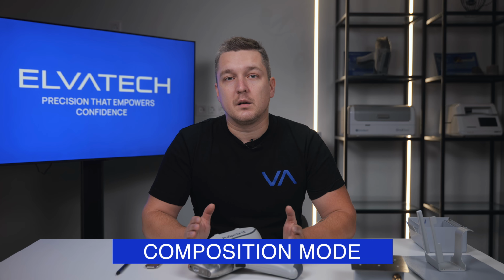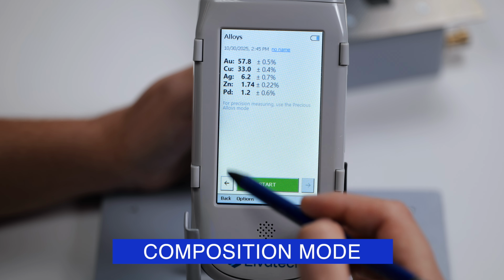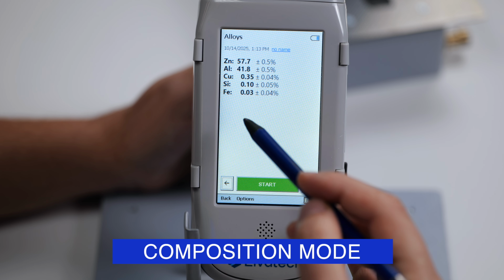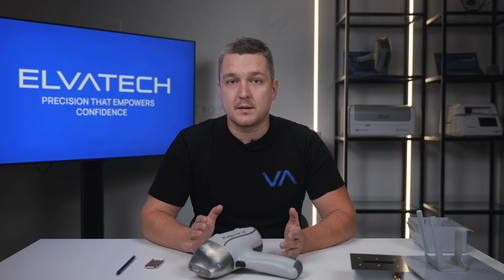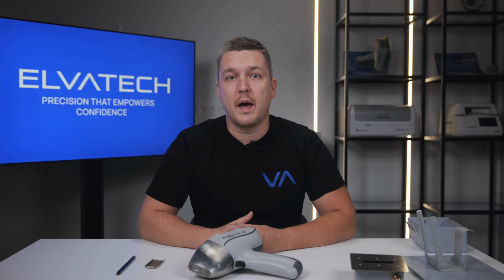The next one is the composition mode. This is the classical quantitative analysis. In this mode, ProSpector 2 shows how much of each metal is in the sample, in percent. This mode is convenient for quickly assessing the material and generating a report.